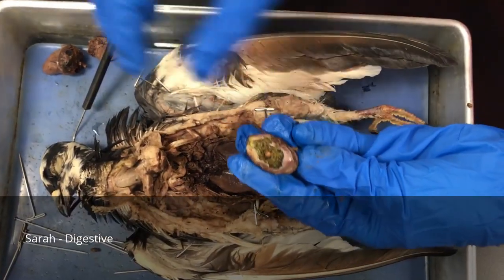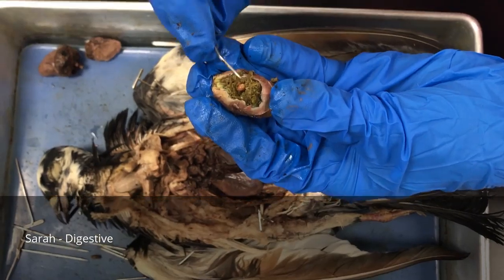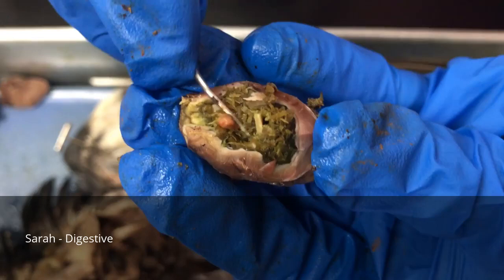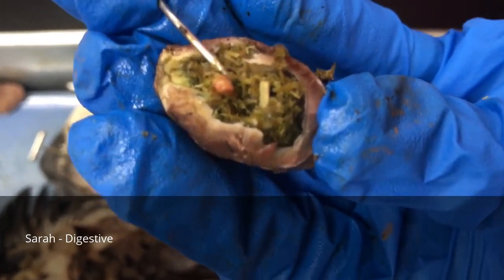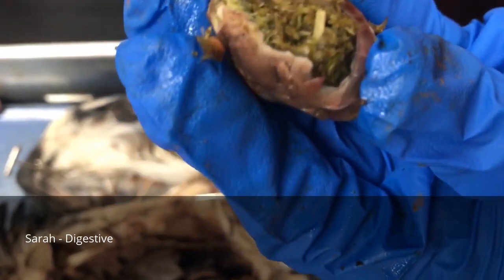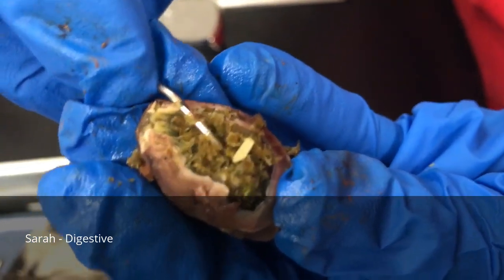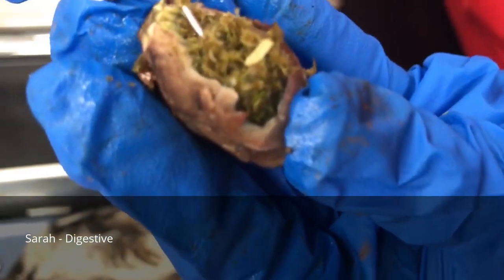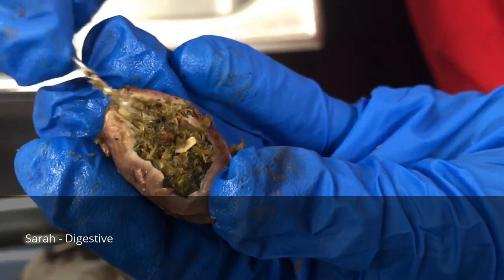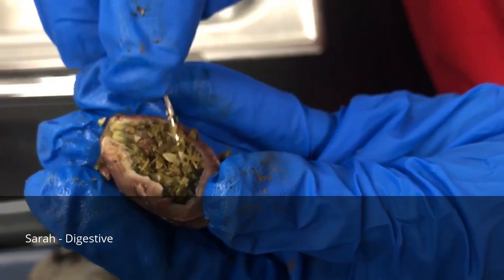Well, here's the gizzard cut open. And the gizzard, like I said, is the place where mechanical digestion is being done after it's gone through the stomach and the hydrochloric acid has broken down bonds to open up the food. Maybe it might be a corn kernel. It might be a seed kernel. It looks like we've got some grain in here. And that's the inside of the gizzard. That's part of his meal that he was digesting before he passed. Oh, and then here's a stone. Like I previously said, they might gulp stones to help with their mechanical digestion. And that's the gizzard.